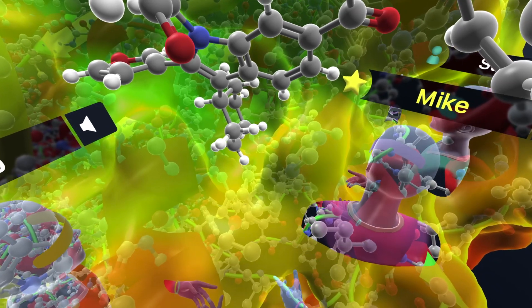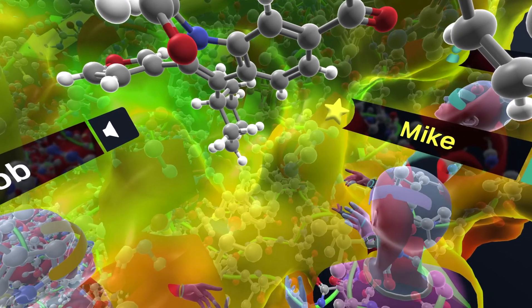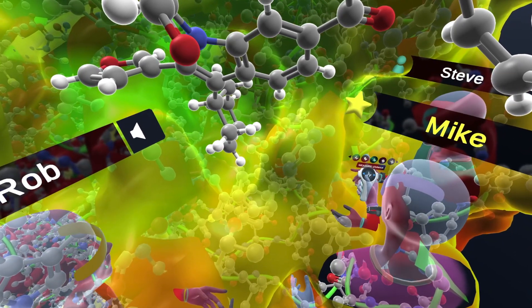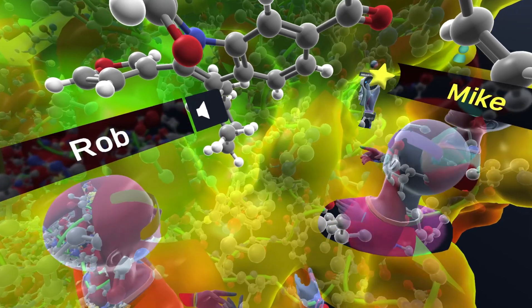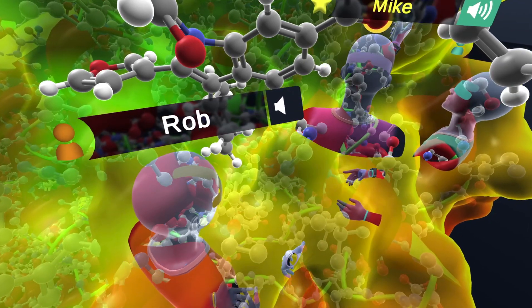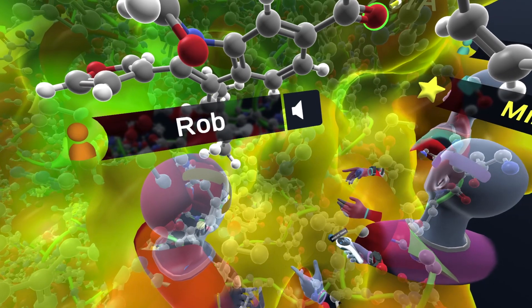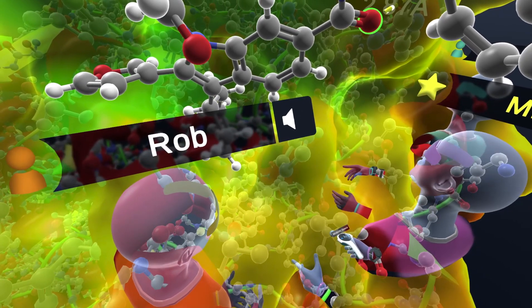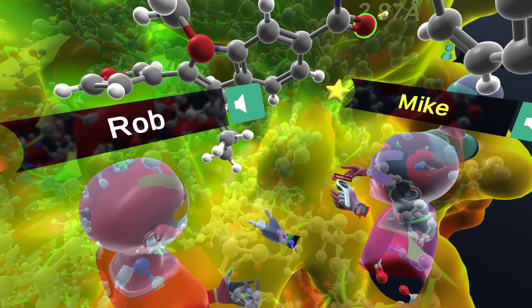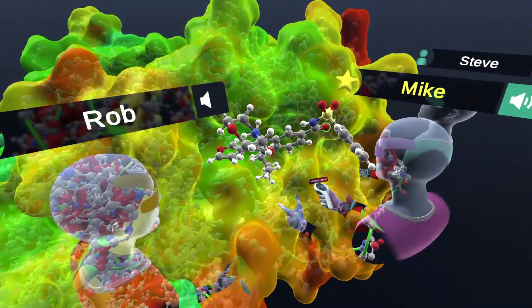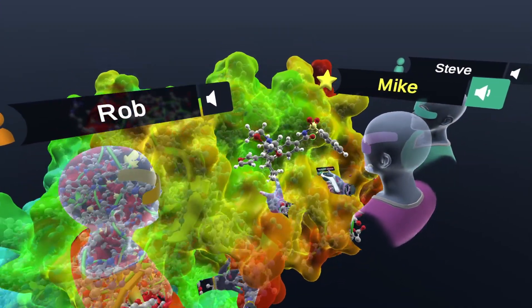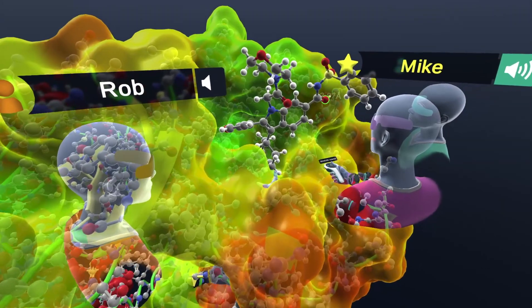There's a really important interaction - there's a hydrogen bond between the carbonyl of the molecule here and this arginine 503. We can measure the distance of that hydrogen bond and you can see it's really a good distance for a strong hydrogen bond. This is the tool molecule that they worked with, but then they did some really cool modifications to get to the actual drug.